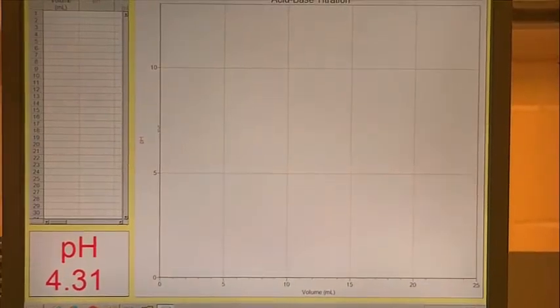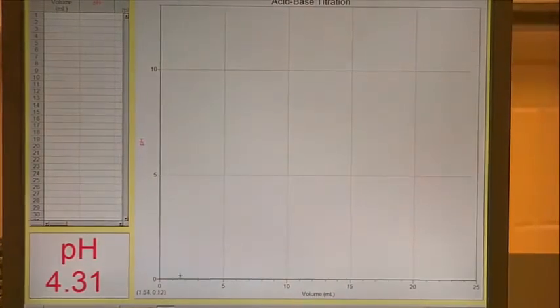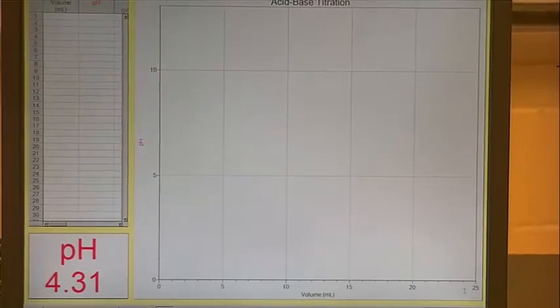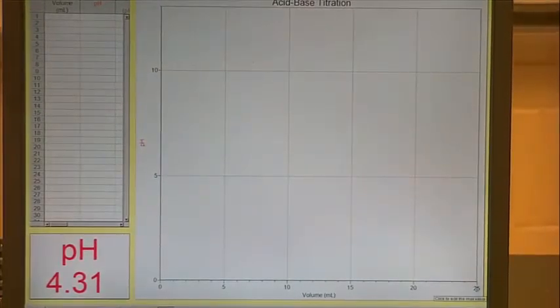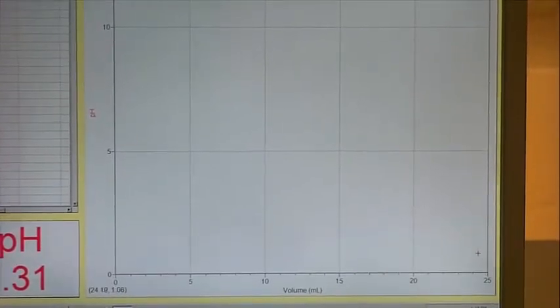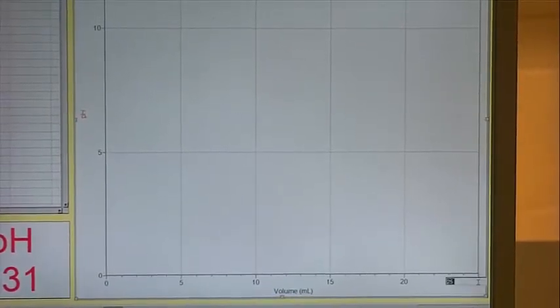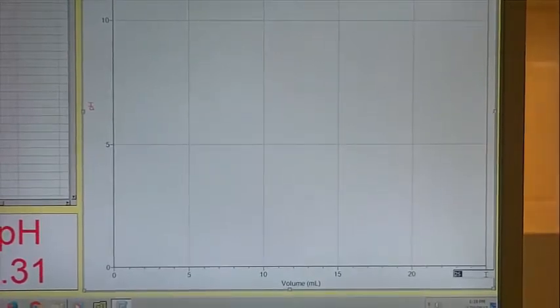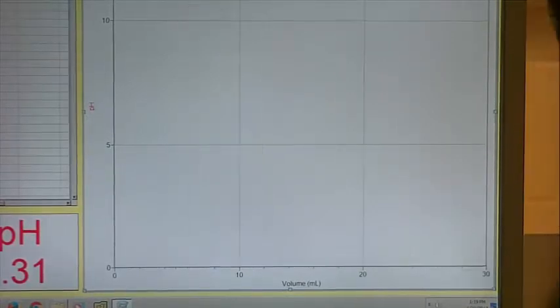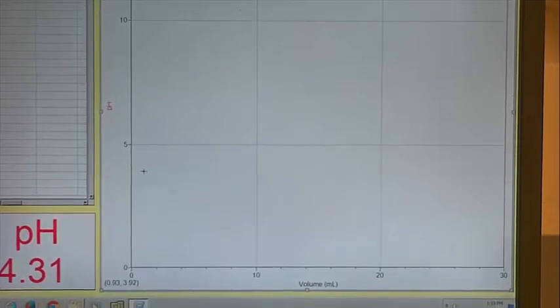On your y-axis is pH. On your x-axis is volume. If you want to change the axis labels, your lab manual says your volume should go from 0 to 30. But I don't know if you can see this, but it's actually 0 to 25. So you're going to go on that 25. You see how the cursor changes. Here it was a plus mark, and now as I go to 25, it's changed into a curvy arrow. Then you want to left click and change it to 30 mils. Hit enter. Now you have 0 to 30 mils volume, and your pH goes from 0 to 10.